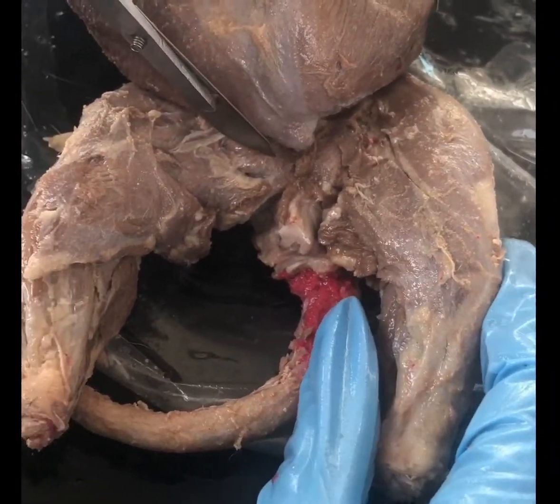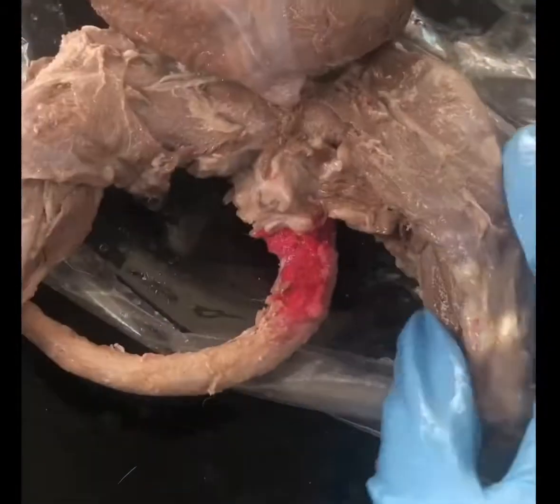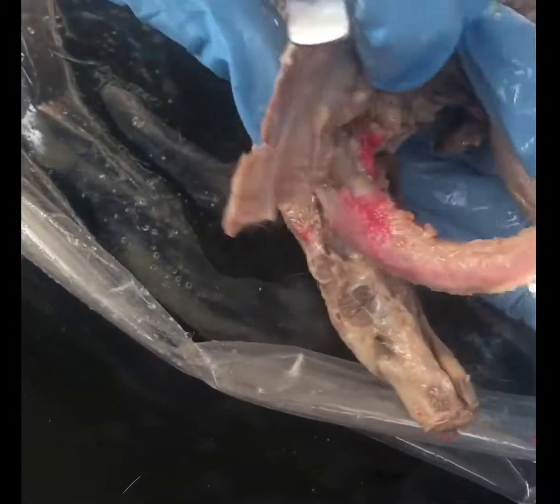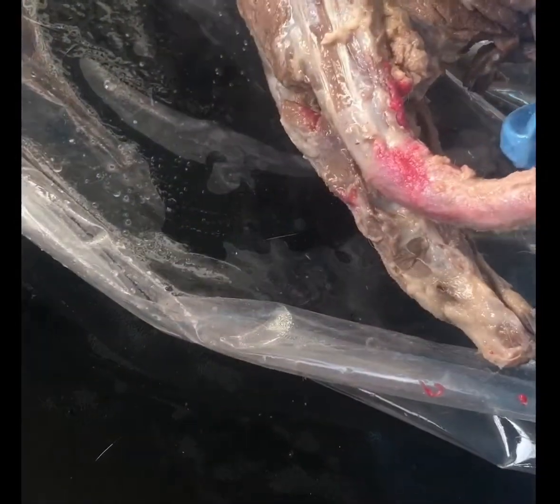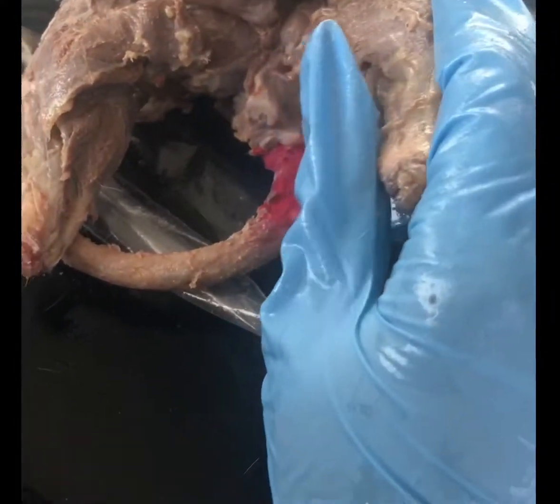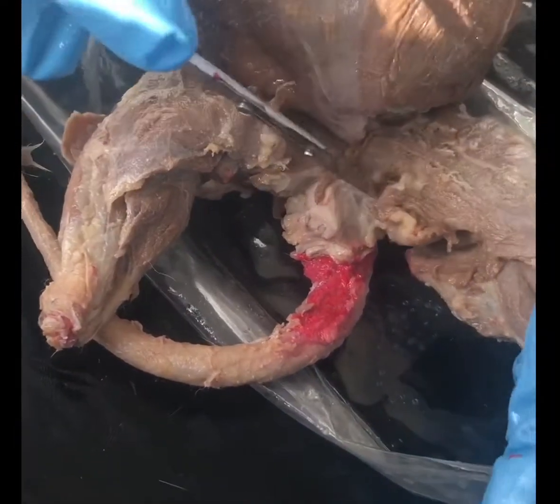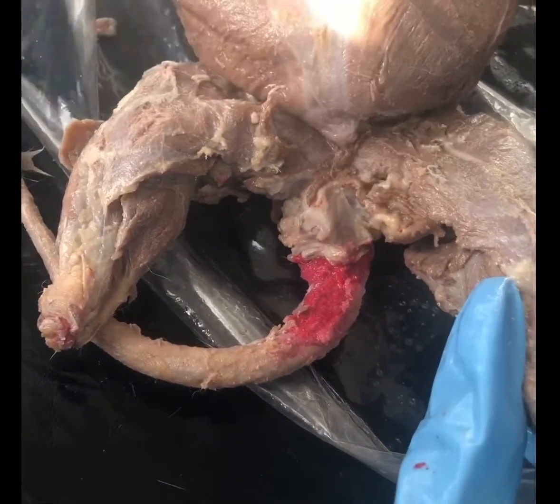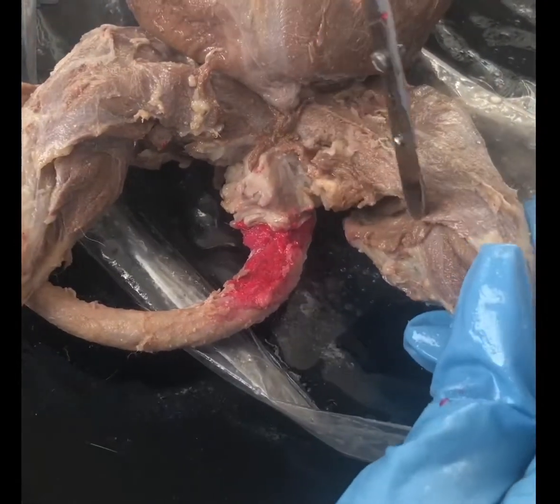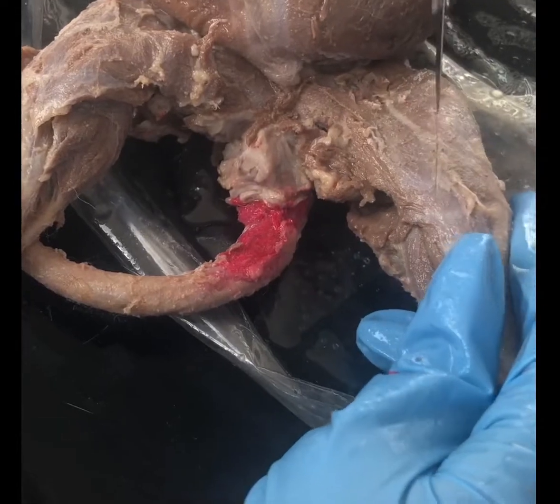Then the adductor longus, which is the inside. It's basically the muscle on the back, on the inside. So it's found like up here, but it's on the inside, so it's like down here. The adductor magnus is next to the adductor longus, but it's more towards the lateral side of the body.